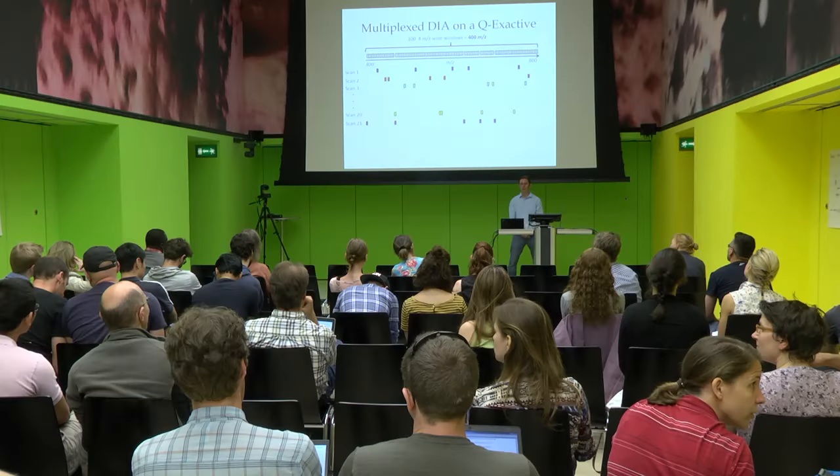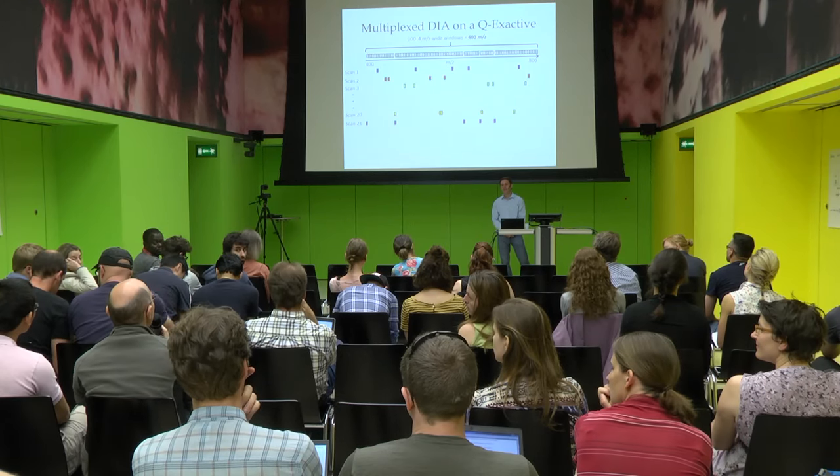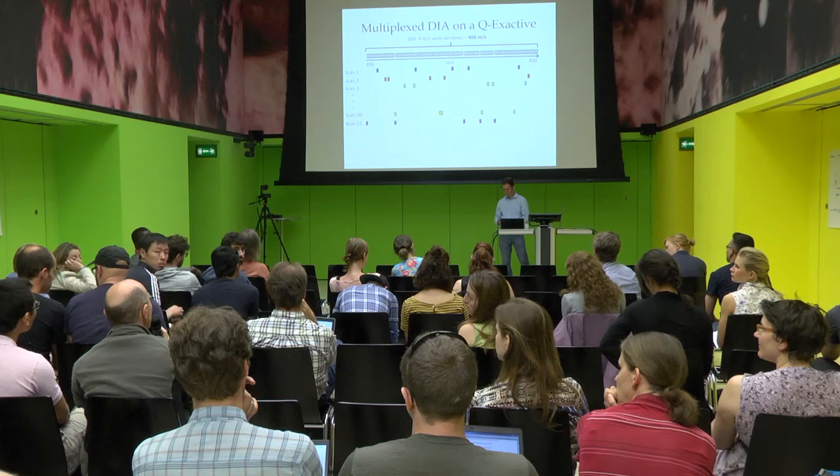Thanks. Ludovic? Yeah, it's to follow up on the question about the sequential filling of the C-trap. Have you tried MSX on an LTQ? I mean, we discussed this. Then, in principle, you don't have to worry about that. You should be fully optimal for your MSX method, right? Yes. So, again, it's almost like I planted you there.